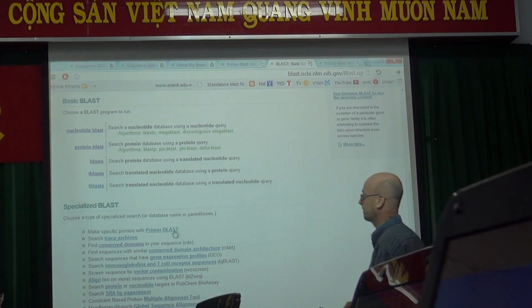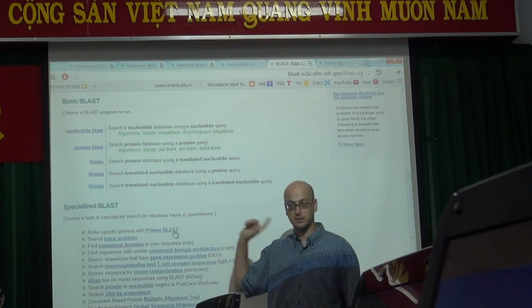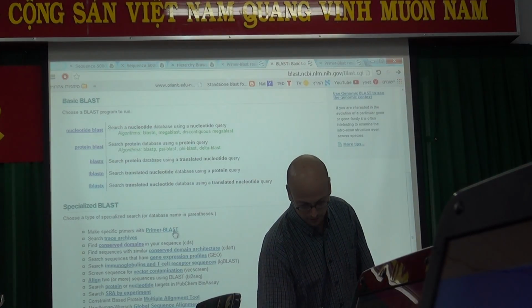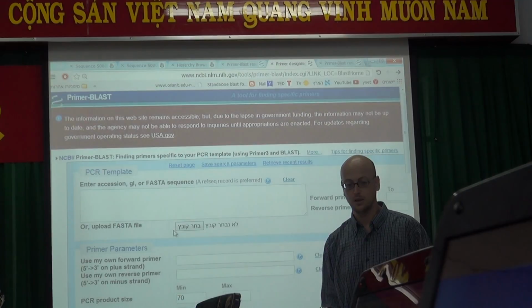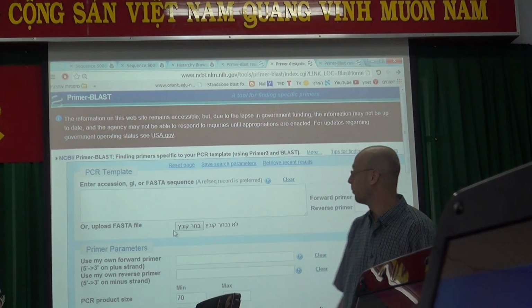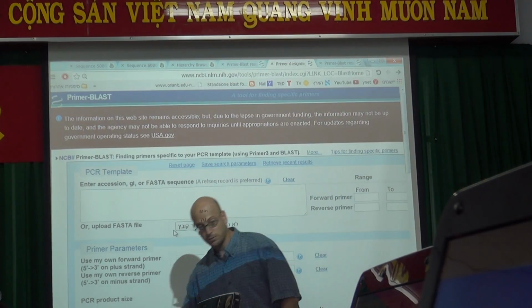We want to make primers with primer blast. Okay? Let's click on it. We go inside primer blast. Now, we have time? Yes, we have some time.